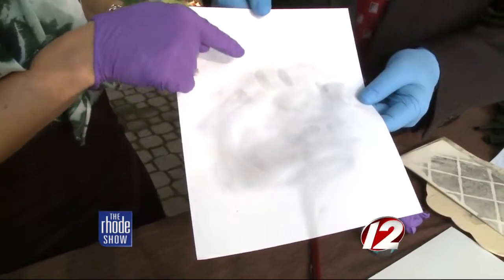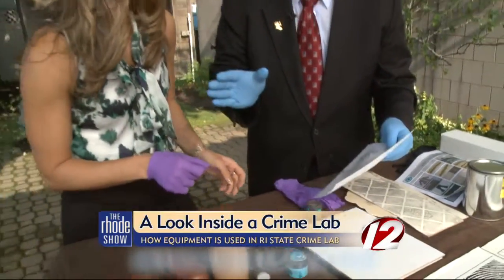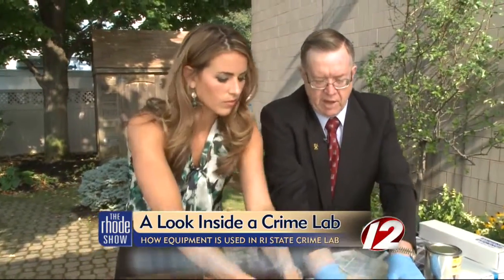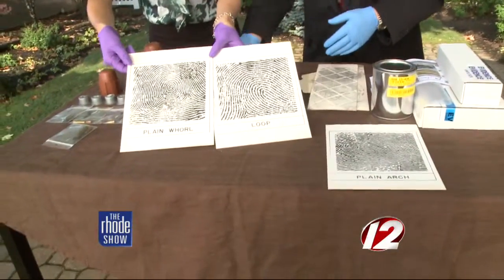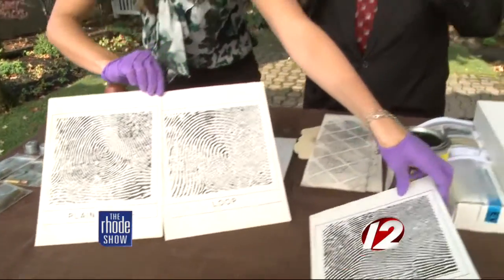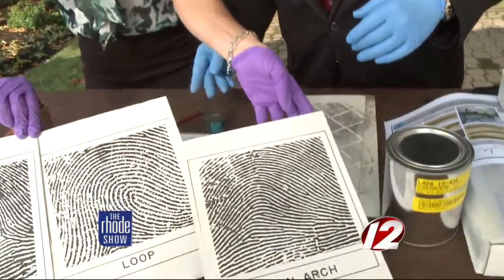Now, how do you determine that this is me? So what we would want to do is take a fingerprint from you and then do comparisons. These are the different types of fingerprints that we have: that's a plain arch, that's a whorl, that's a loop and an arch. So you would have one of these designs on your own fingerprints. I think you had loops here, a whorl and an arch — so you have all three of them on that one hand.